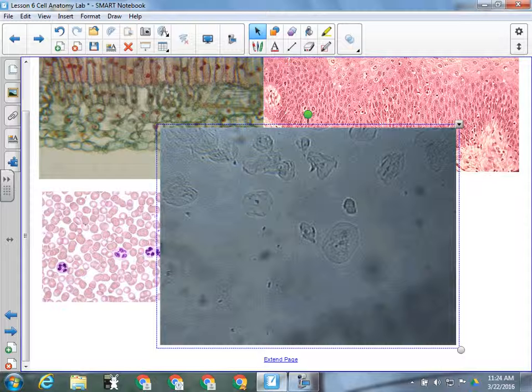Other thing, if you're wearing, what's the stuff that makes your eyelashes thicker? Mascara. Okay. Sorry, I'm a guy. I don't know that stuff. That oftentimes will come off while you're looking in the microscope and you're blinking. It comes off on the microscope on that ocular lens, and it really makes them dirty and oily. So if you could maybe not put that on until after the lab. No makeup day maybe. It does create a bit of a cleaning problem for us, so if you could avoid that, it would be much appreciated.